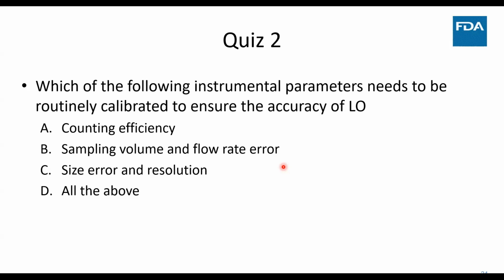I'll show something here that raises concern when it comes to particle analysis: what type of standards we are using for calibration. It's not a topic we are discussing today, but I think it's something we'll have to think about more going forward, especially when it comes to products like biologics, nucleic acid-based products, and other complex products. Because if you're using a sphere for all your calibration, and then you're looking out for a particle, even a glass particle, very different characteristics from your calibration. So it raises the question, how really valuable is your calibration standard? I think it's something that is really going on in the particle size community, especially as it pertains to biologics, but it's something that all of us would have to think about going forward.